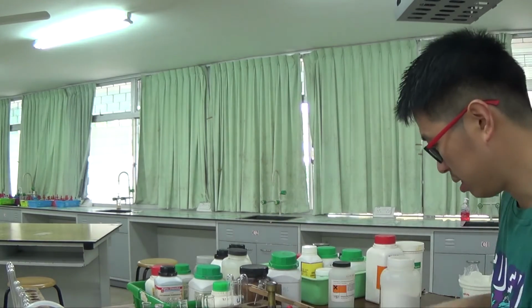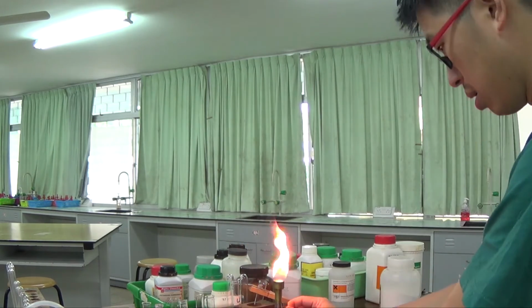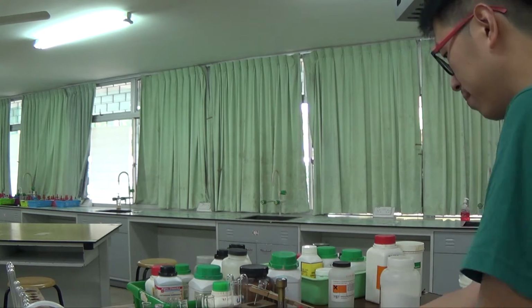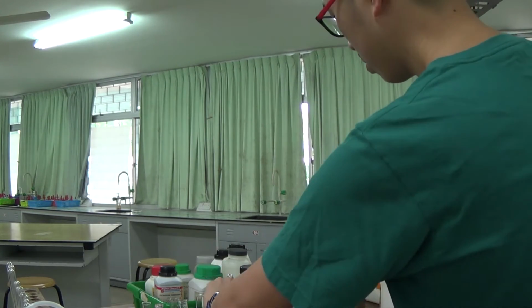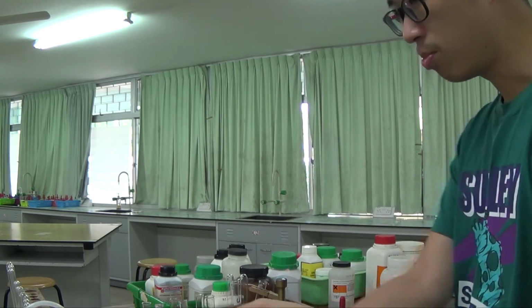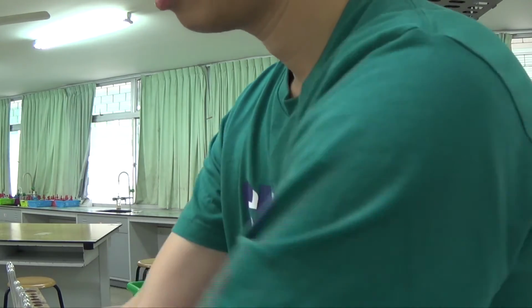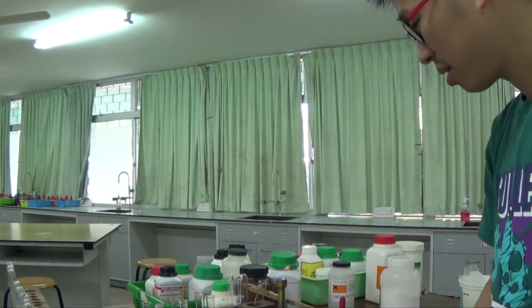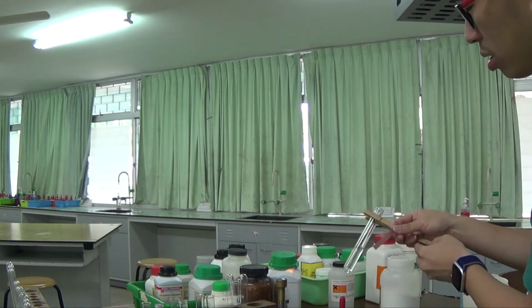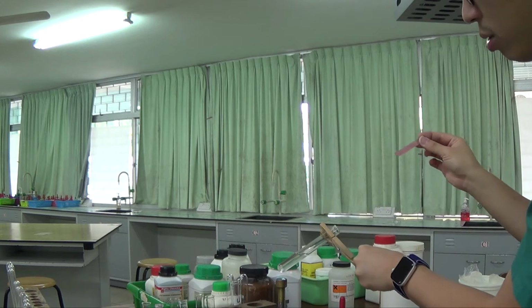So what happened then is, well, let's light up. Blue flame. My red litmus paper, I should moisten it with a little bit of distilled water so that it's wet. Remember, you're testing for the gas, therefore do not insert this into the side of the test tube which contains sodium hydroxide.